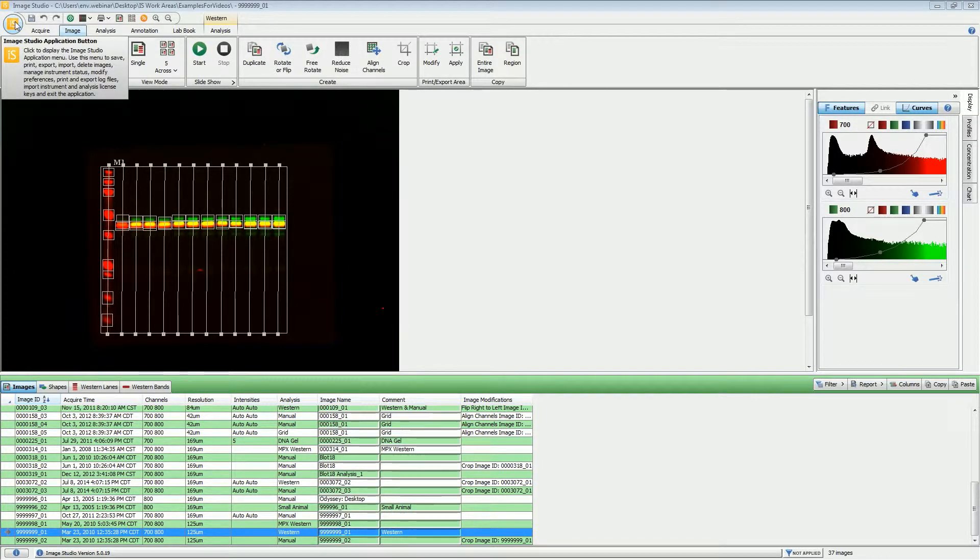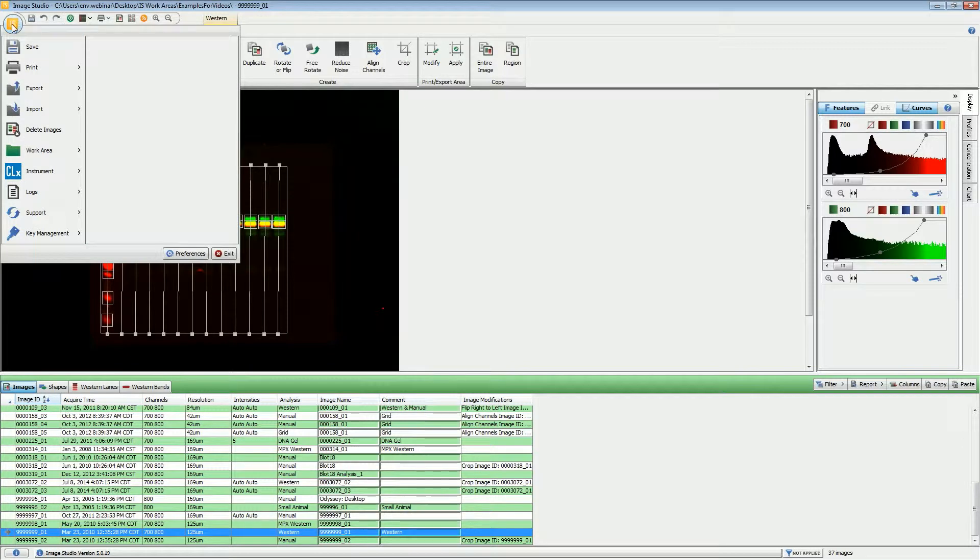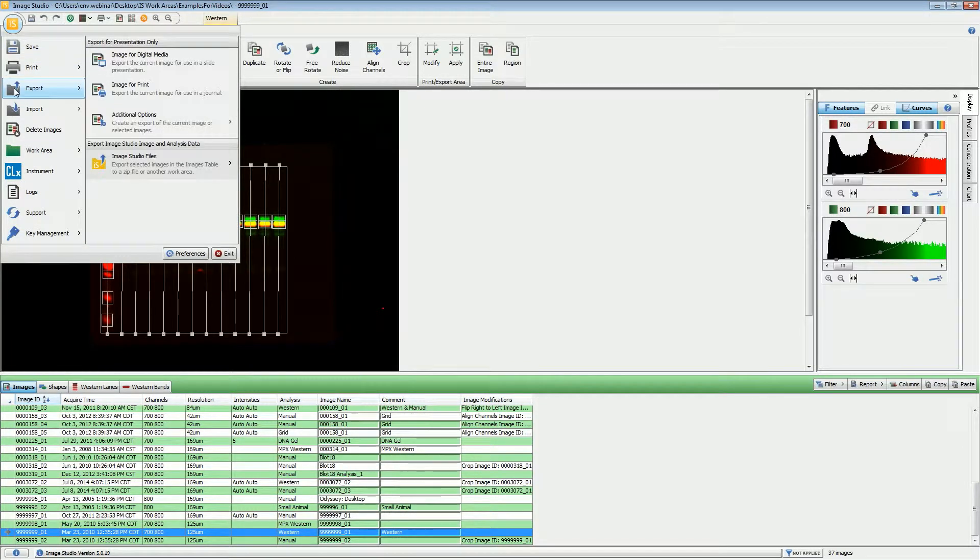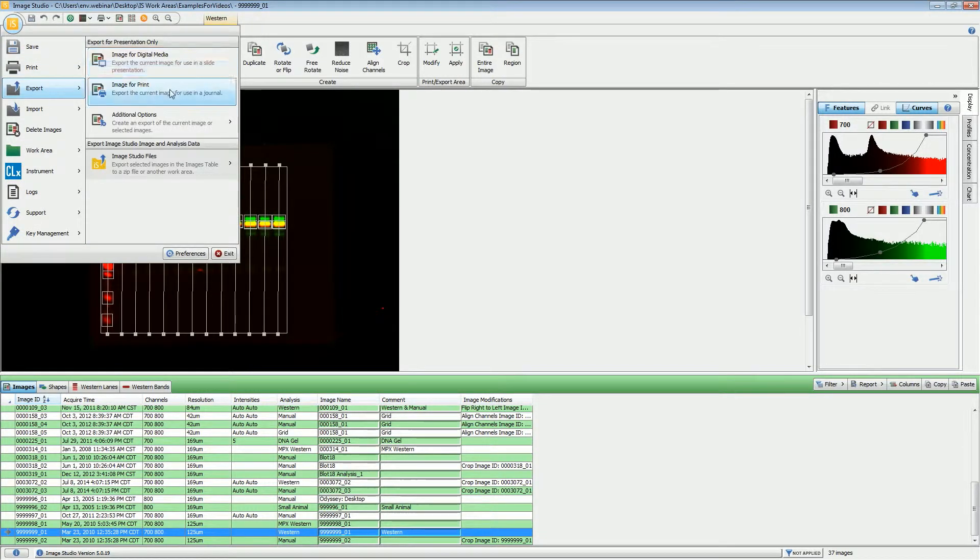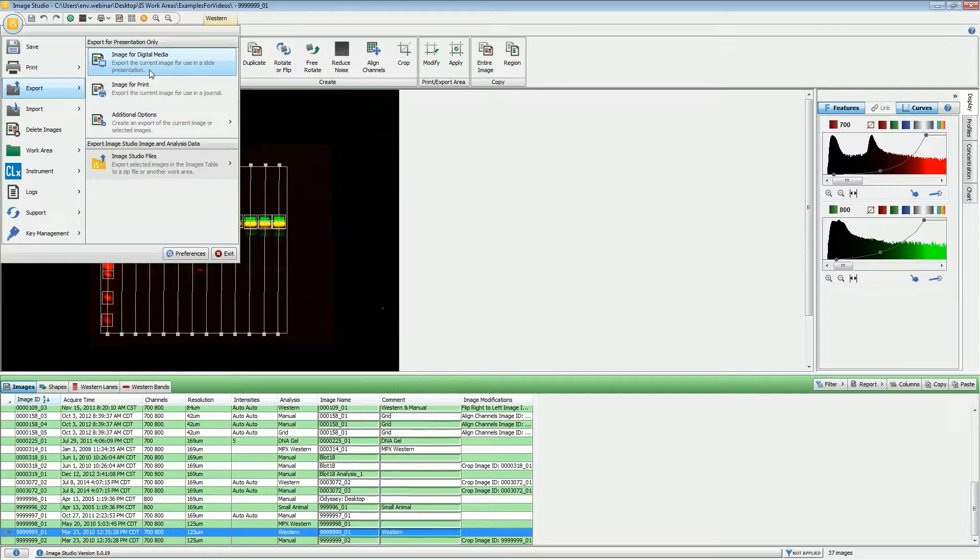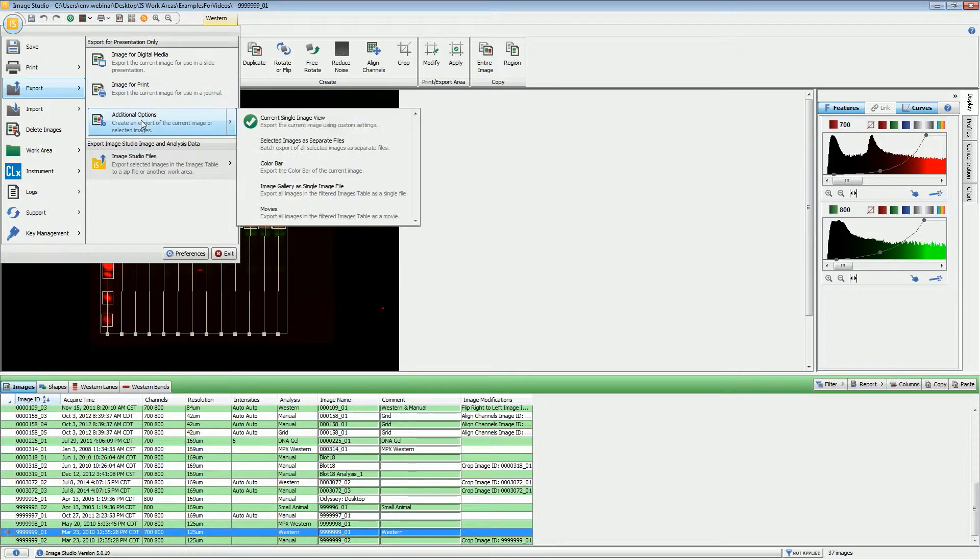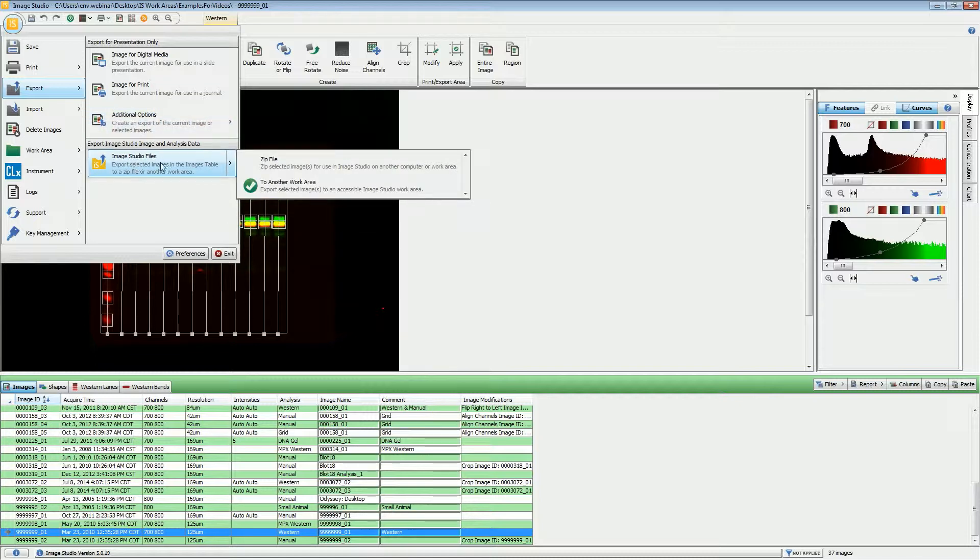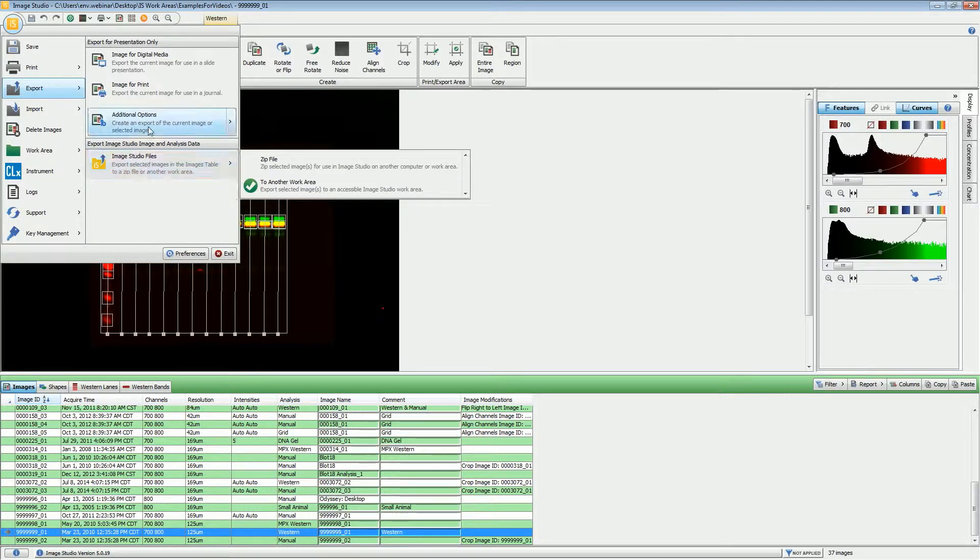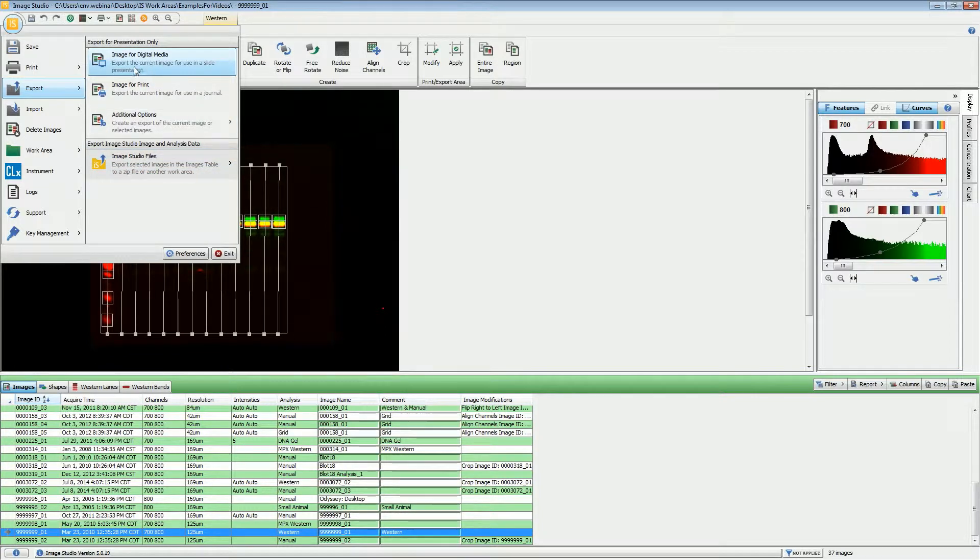Then choose which type of export you would like to do. If you're doing something like a PowerPoint or web presentation, you would choose For Digital Media. If you will be printing or if the image will be used in a journal, you choose Image for Prints. We also have some additional options which I'll discuss momentarily, and I'll also discuss how to move Image Studio files from one work area to another.